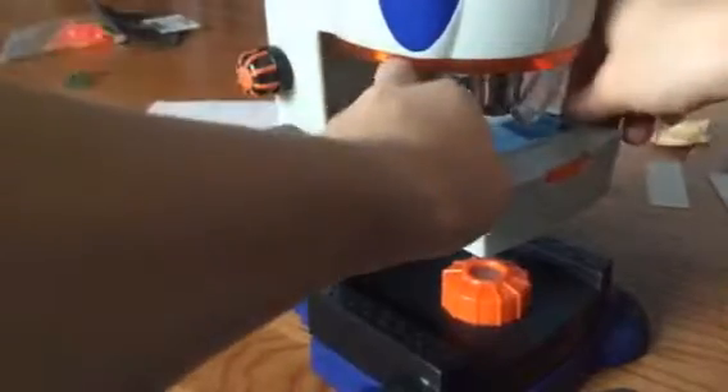So what you want to do with these is you don't need to know all the stuff that comes in the tray. Here's the tray and as you can see those bits are very good stuff. They got the black one, and today I'm just going to put some wood stencils into the thing. I'll show you that in streaming action. Now I'm going to put some wood stencils into the tray and put them in right here.